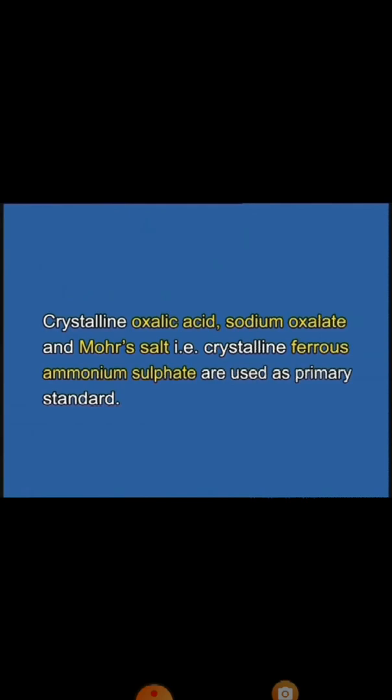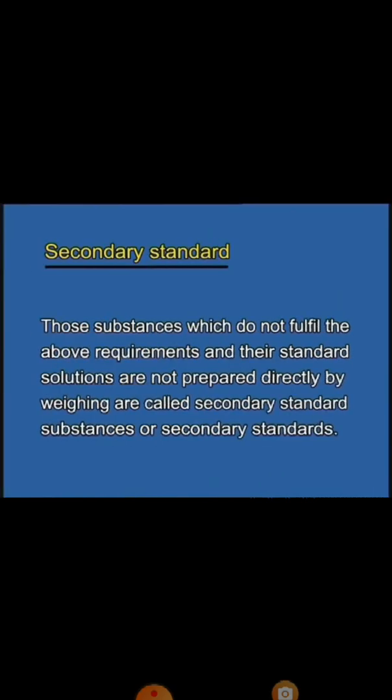Crystalline oxalic acid, sodium oxalate and Mohr's salt, that is ferrous ammonium sulfate, are used as primary standards. Secondary standard: we will learn here what secondary standard solutions are.